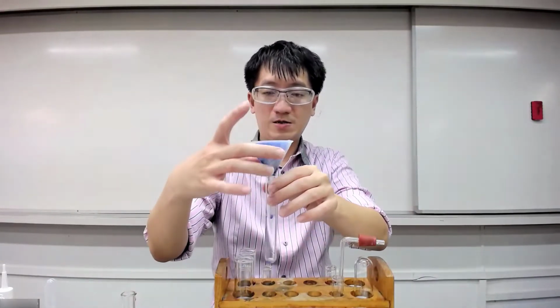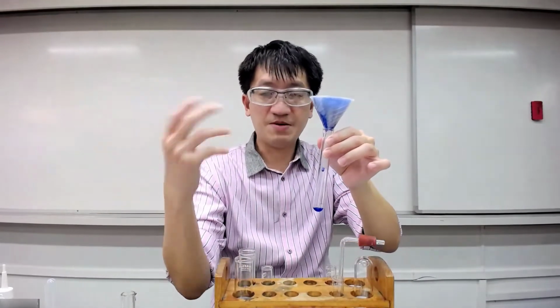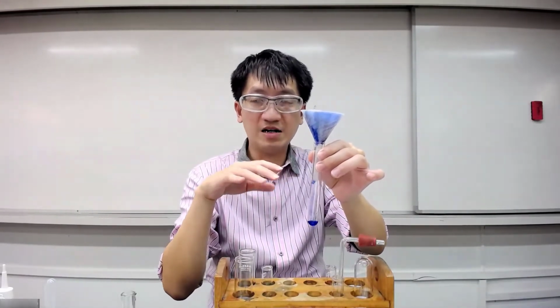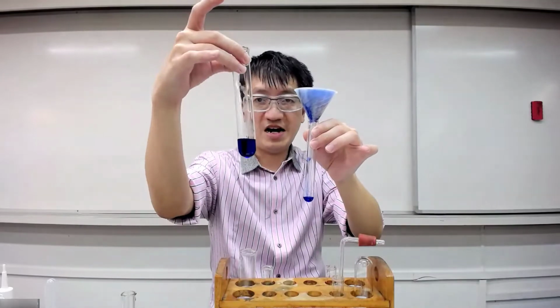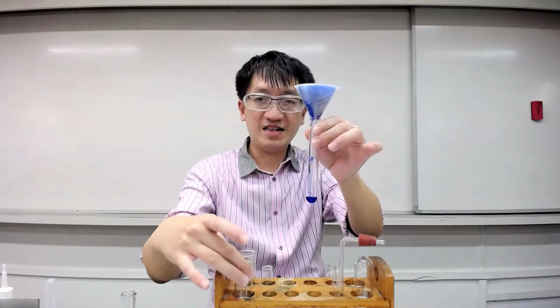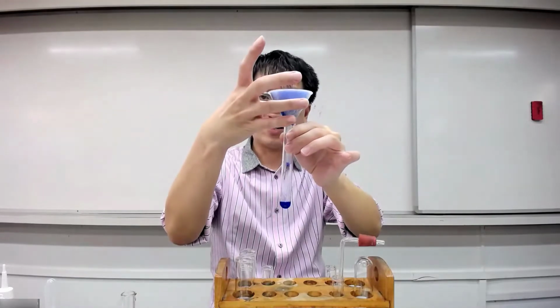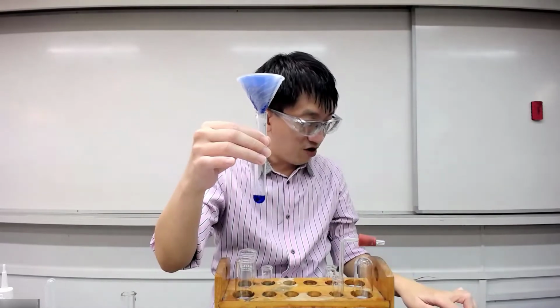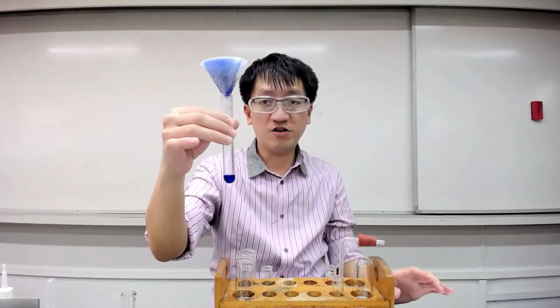Like this. And this is a good habit, just to showcase to you. Because many a time I noticed that students during practical just sit there and wait. Sometimes you can just play around with test tubes. For example, now I have this test tube, right? After I filter some of the solution in, then I just transfer it into this. Later on, I know that I need about 2 cm depth of the filtrate to add sulfuric acid. So later on, very quickly, I will transfer this back into the boiling tube. After that, I'm supposed to wash the residue thoroughly with deionized water and then discard the washing, retain the residue for use in part C.